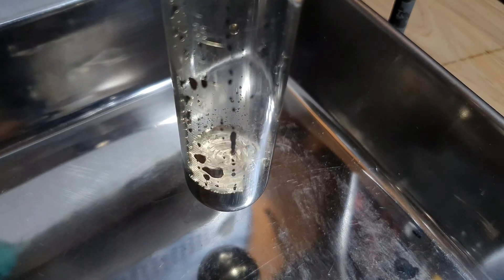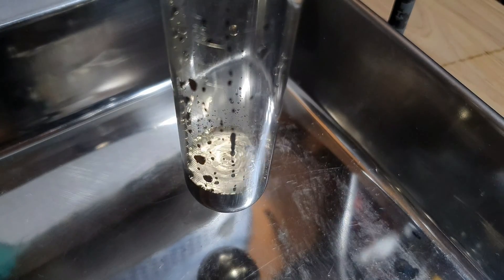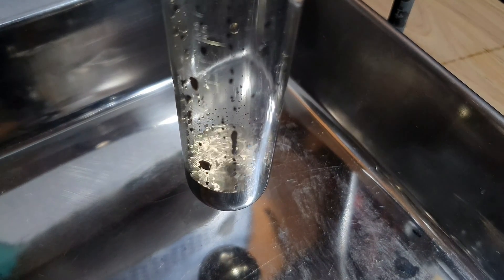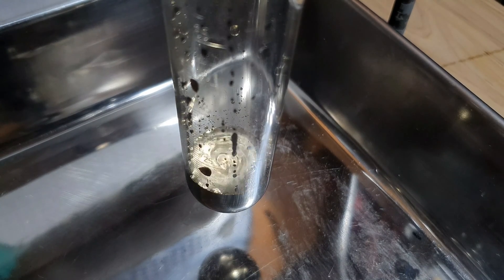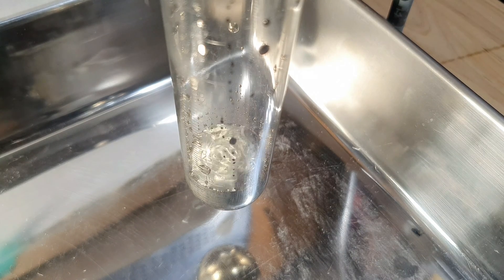I still, for the love of god, can't figure out the correct lighting setup to capture the beautiful color of cesium. What I thought was interesting is that you can see the vibrations caused by the vacuum pump on the surface of the cesium — it almost looks like one of those resonance patterns formed by sand when exposed to sound waves.